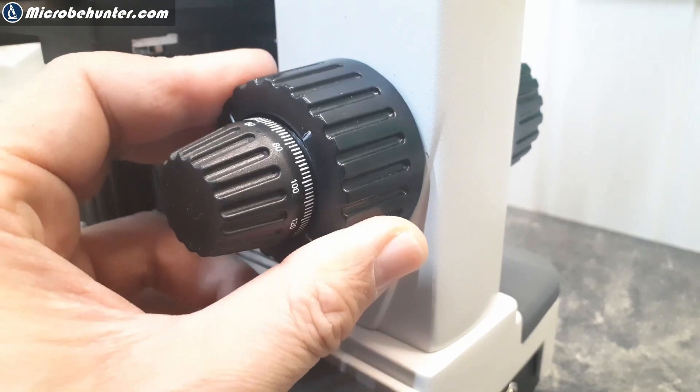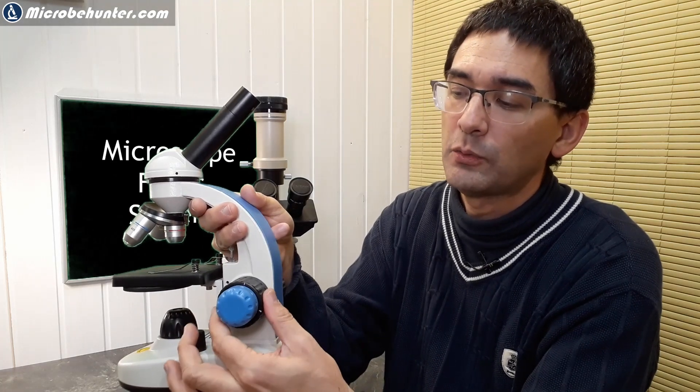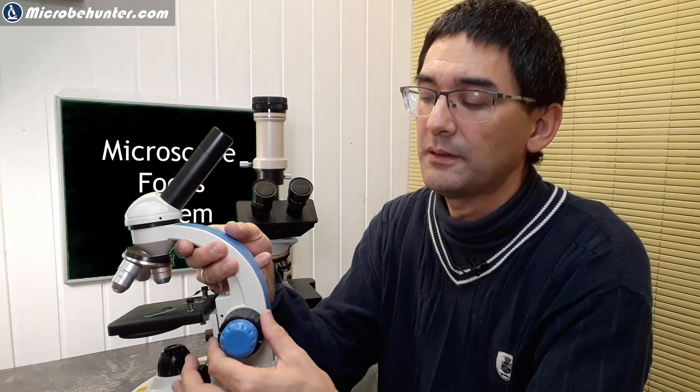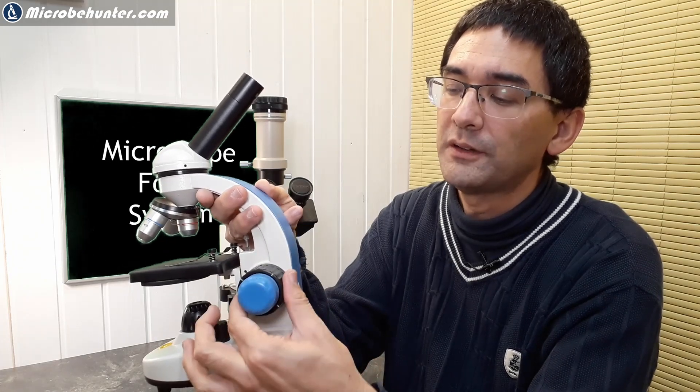All better microscopes have a decoupled system where the fine focus knob doesn't spin with the coarse. The mechanics are probably a bit more complex in those systems, which is why on lower-cost microscopes you often find that the coarse and fine focus knob is combined. But I would say this is not a big issue.